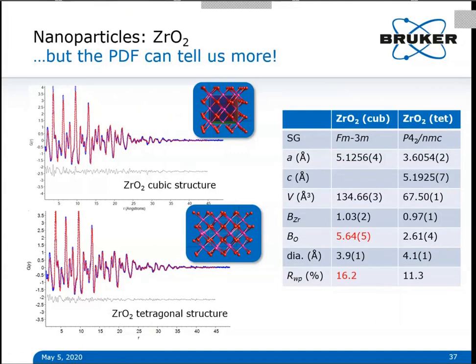Now, there's a question also on why you would use a Göbel mirror. Is it recommended to use a Göbel mirror to enhance the intensity if you have a multifunctional user system, so an XRD equipment that's used by many different users? Would you recommend a Göbel mirror? Well, yes, I would actually.